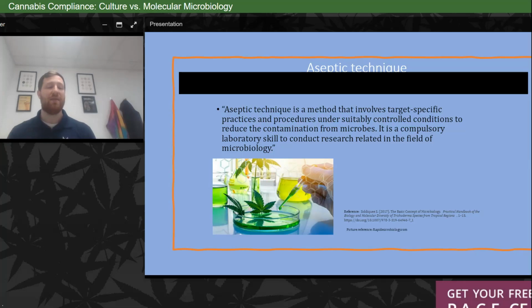Everything that we use in the microbiology lab should be sterile. There are several ways that we can go about sterilizing and confirming aseptic technique. In the past, if they were reusing things, people would flame sterilize, especially if we're pouring agars or using reusable loops. We would flame sterilize to confirm sterility.